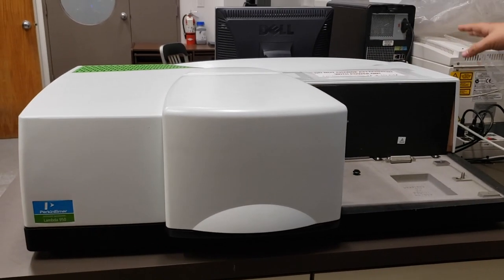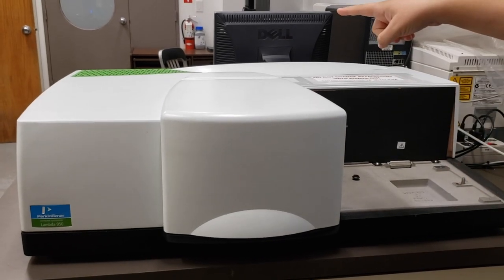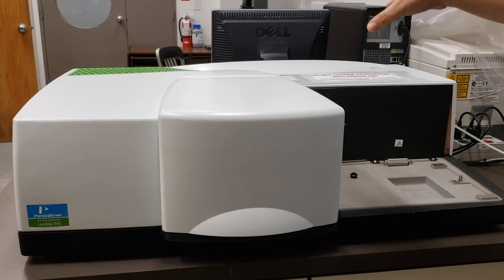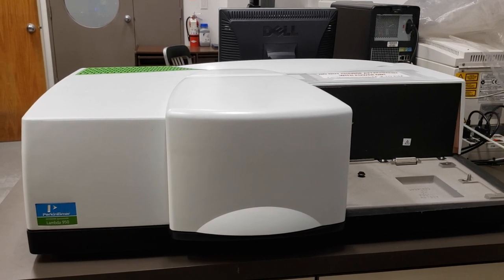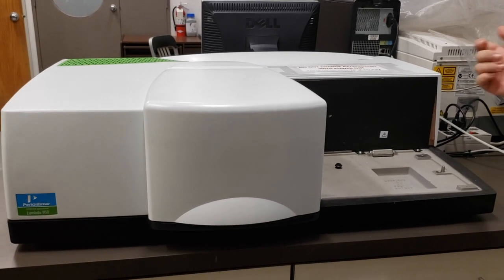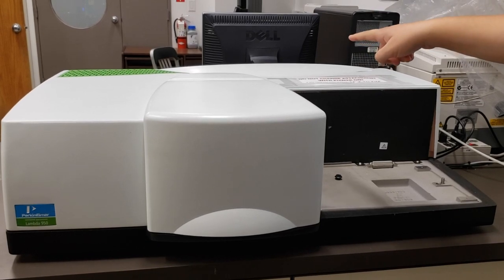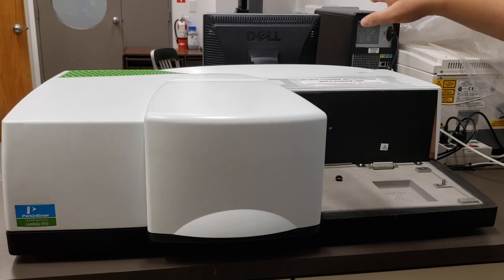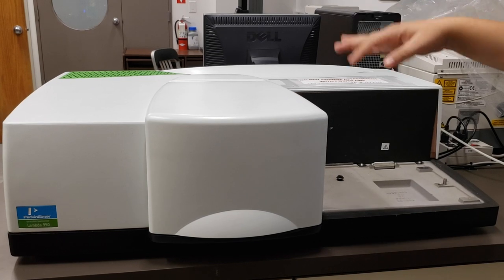What you're looking at here is the base of the instrument without any detectors installed. The light source is behind that green mesh in the top left corner. We have both a tungsten lamp and a deuterium lamp, which cover the full range of wavelengths. The light from those lamps is then filtered through a monochromator, located about in the center of the instrument. The monochromator is basically a prism that separates out the wavelengths of light from those two lamps.